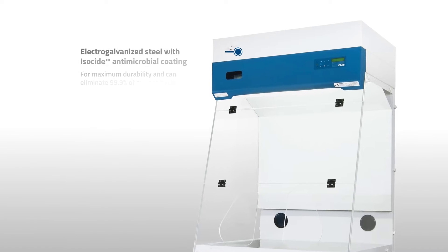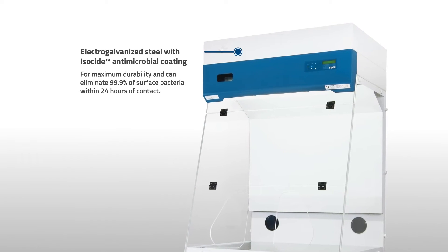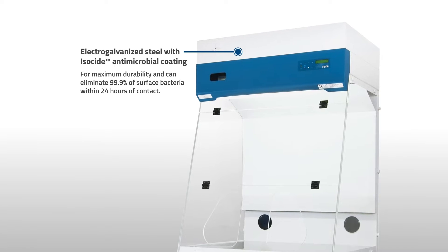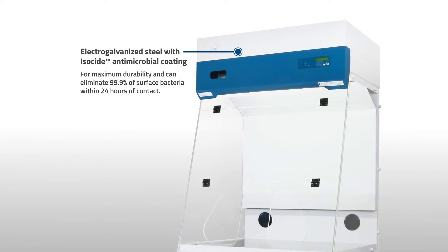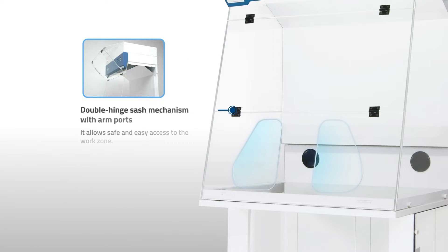Construction features include external electro-galvanized steel with iso-side antimicrobial coating for maximum durability, which can eliminate 99.9% of surface bacteria within 24 hours of contact. A double-hinged sash mechanism with arm ports allows safe and easy access to the work zone.